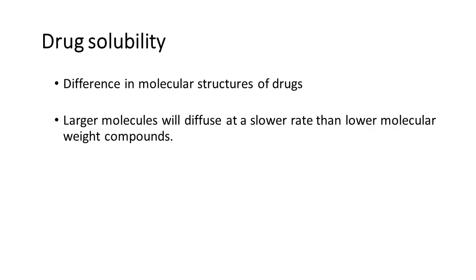Drug solubility. The solubility differs with the molecular structure of the drugs. So a larger molecule will diffuse at a very slow rate compared with lower molecular weight compounds.